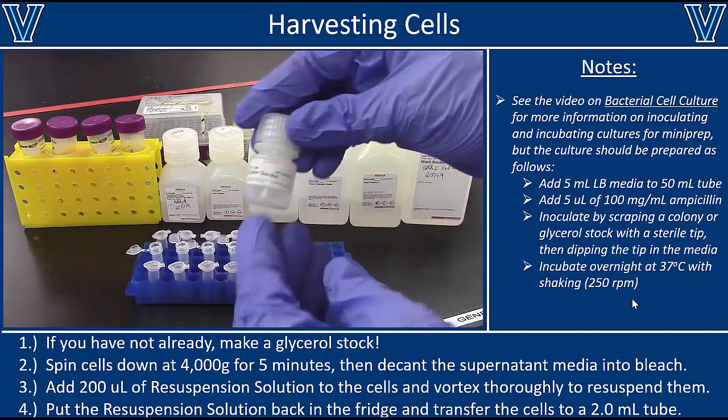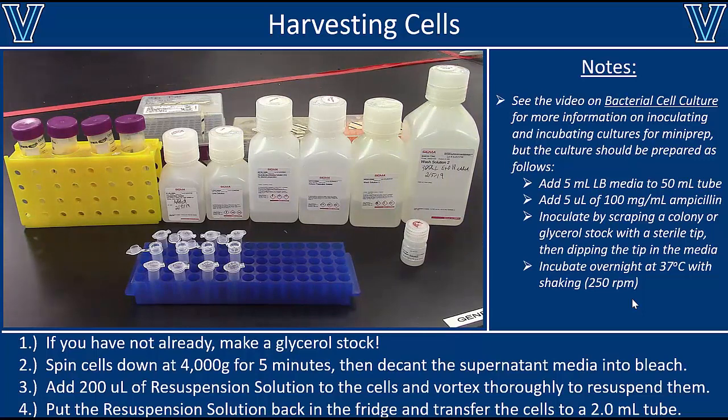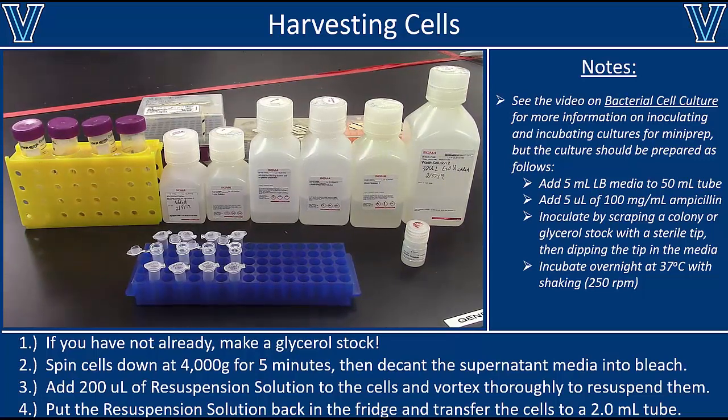You want to make sure that you have ethanol in it, and you want to make sure you have some elution solution, which could just be ultra pure water. All right, now we've got everything, let's get started.